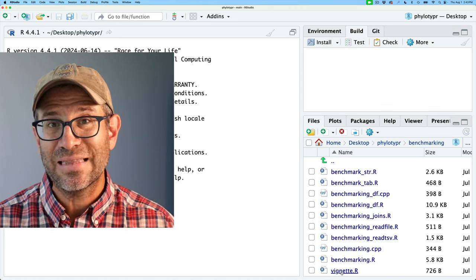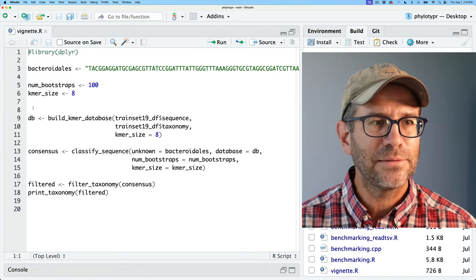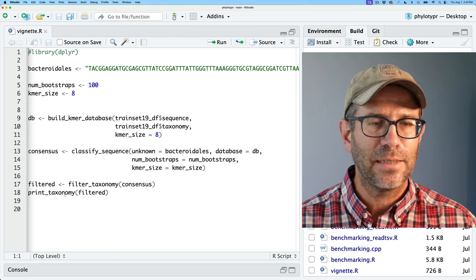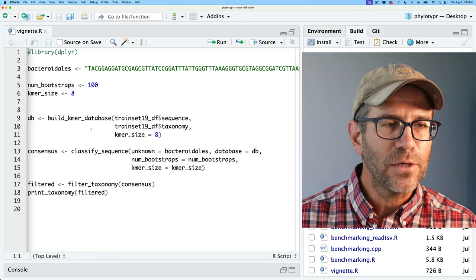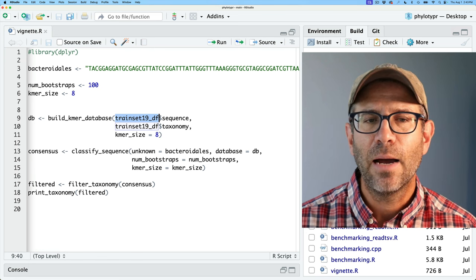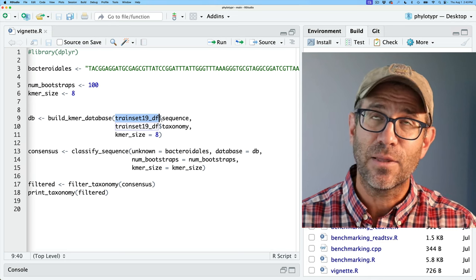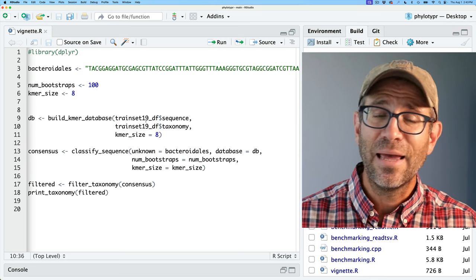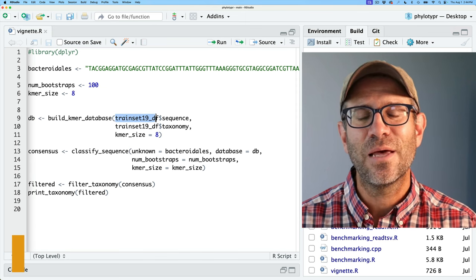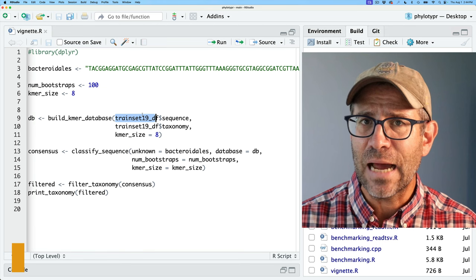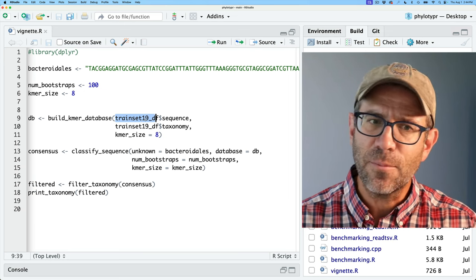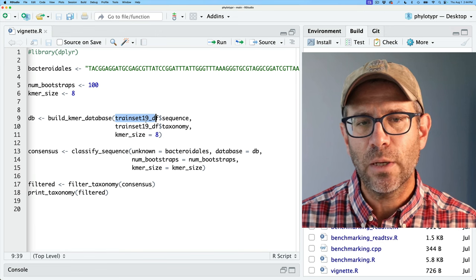To orient ourselves, if we go into the benchmarking directory, I've got this vignette.r script that has a sequence, some parameters, information on loading the database, getting a consensus sequence, filtering that, and printing out the taxonomy. So it's got a variety of functions one might use to classify sequences. In here I was assuming a person might read in the trainset19_df database — something we made two or three episodes ago. What I found was that it was actually pretty big, and I'd rather make trainset19 part of its own package. So today I want to use trainset9 instead, which is the first version that mothur used for classifying sequences. It's a fair bit smaller and has served well for tutorials and demonstrations.